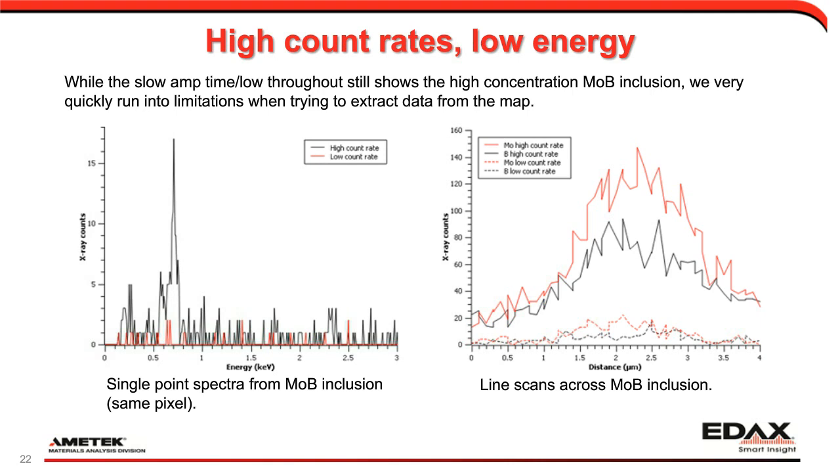We've always pushed faster, higher count rates for mapping, and that works very well when you have the high energy lines, as Tara was showing with nickel, titanium, vanadium. That's easy enough. The tricky part is the low energy range, where we now can run very, very fast on these very light elements as well, and get meaningful data based on good statistics in a short amount of time.